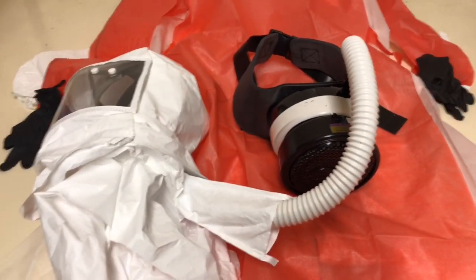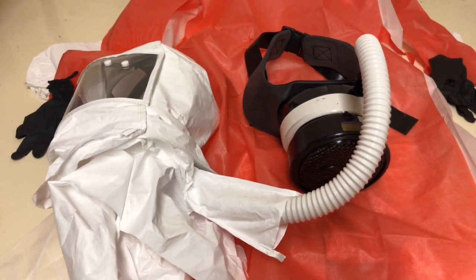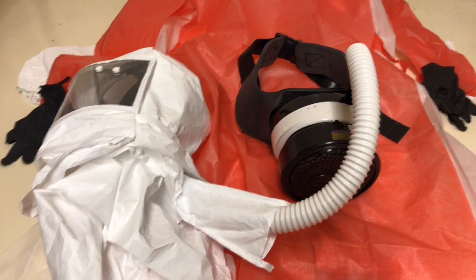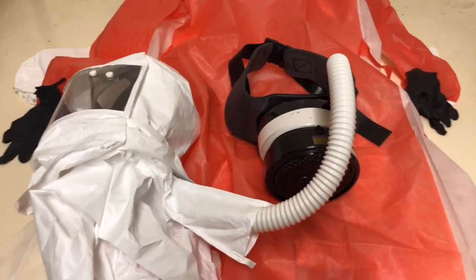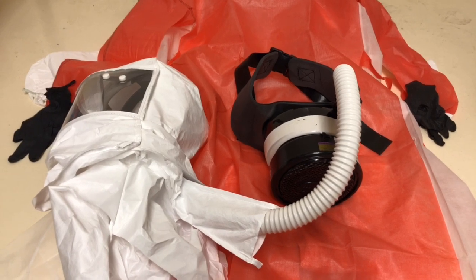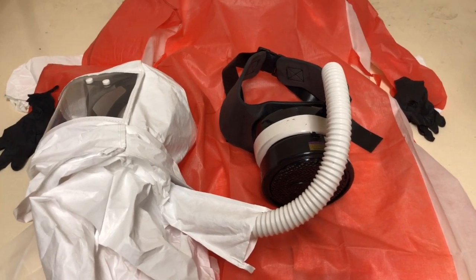And we're actually in a room that is under negative airflow, so things are being sucked out of that room and through a HEPA filter anyway. So we're very much protected from anything that may be aerosolized in the room. Not that we, in principle, aerosolize anything in the room anyway. As I'm about to show you, there is another layer of protection before we even get to the viruses.